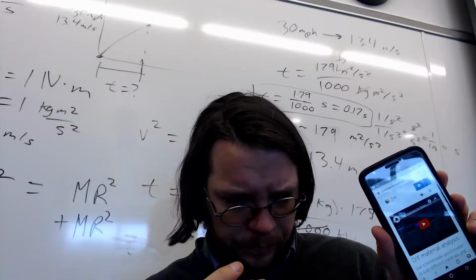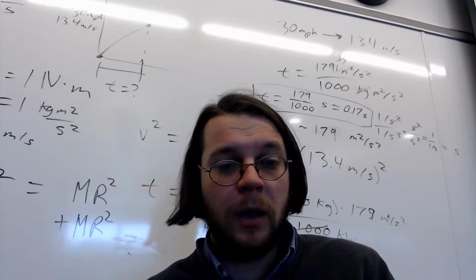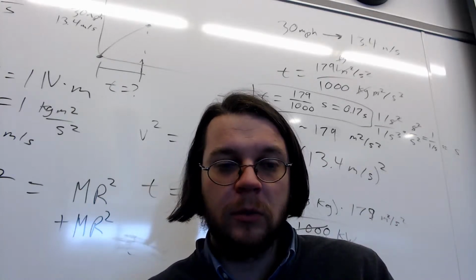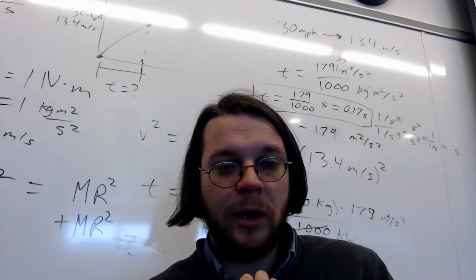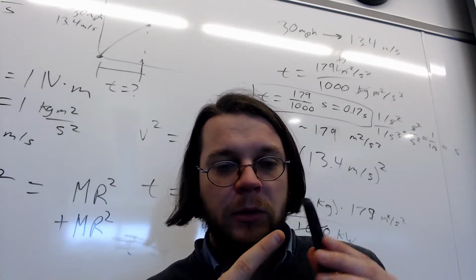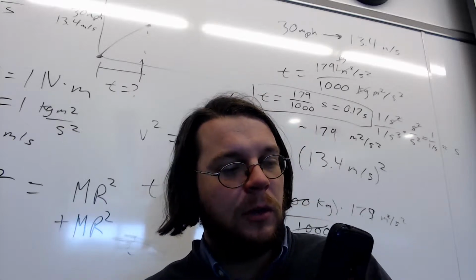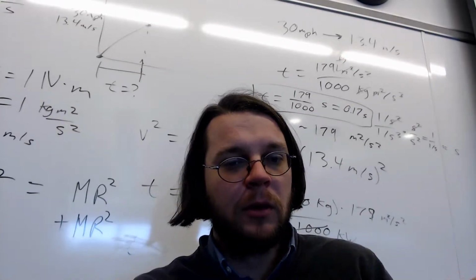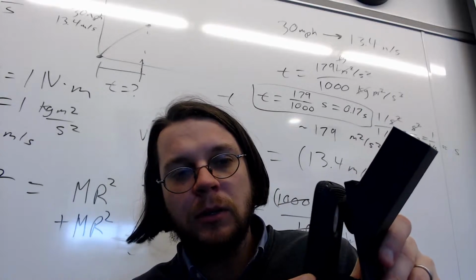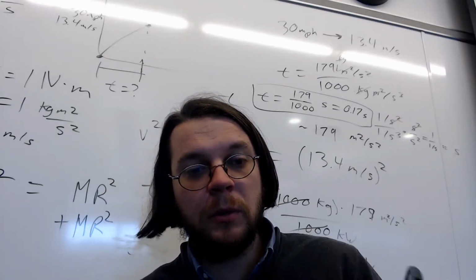So the default browser on Android phones is Chrome, but when I tried this using Chrome, the problem that I have is that I could not choose the back-facing camera, which is this one. By default, it was giving me the front-facing camera here, which is not what I need because I really need to put the back-facing camera up to this device so I can get a nice spectrum. So I need to be able to select that.